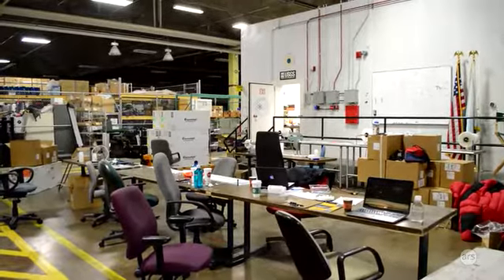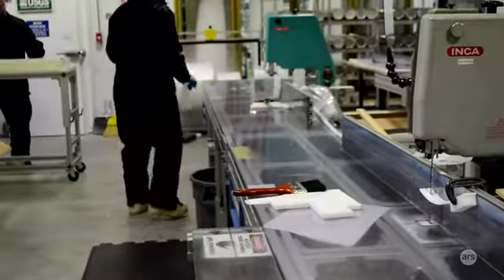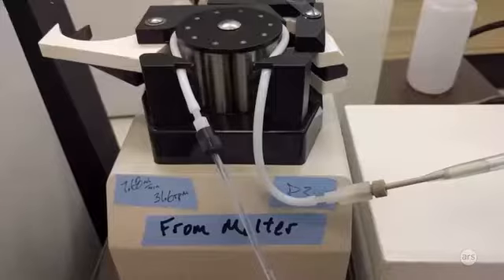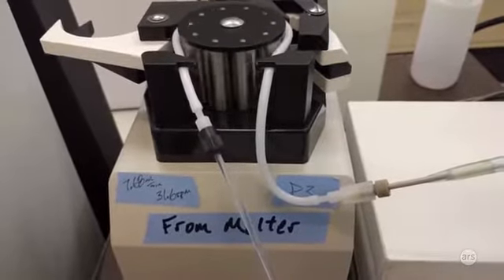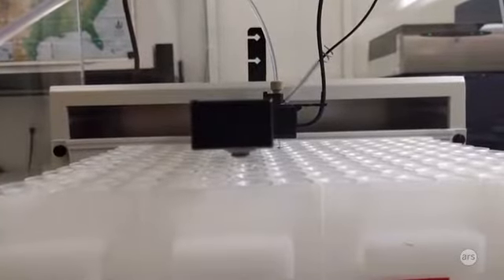The outside of the core is contaminated. The outside of our stick is also contaminated, though somewhat cleaner. And then we melt it over a melt head that's even smaller diameter. And then the outside of that goes to waste. The inside, which is now clean, we analyze. But the ends of the sticks are still dirty. So in that freezer, we sit and scrape all the ends before we melt them. And then we actually melt it in a freezer, but it's just like a convenience store freezer, one of those little stand-ups.